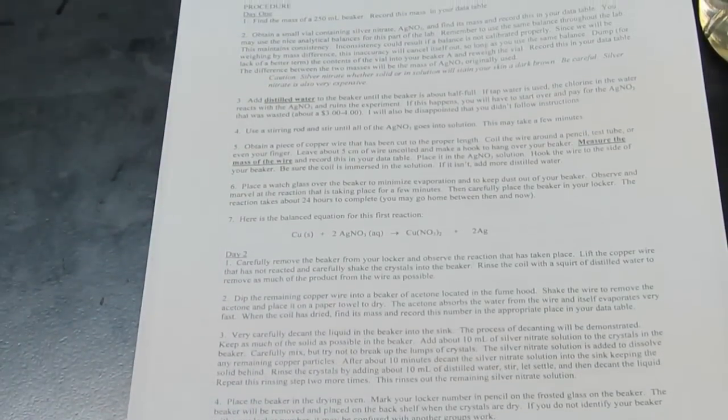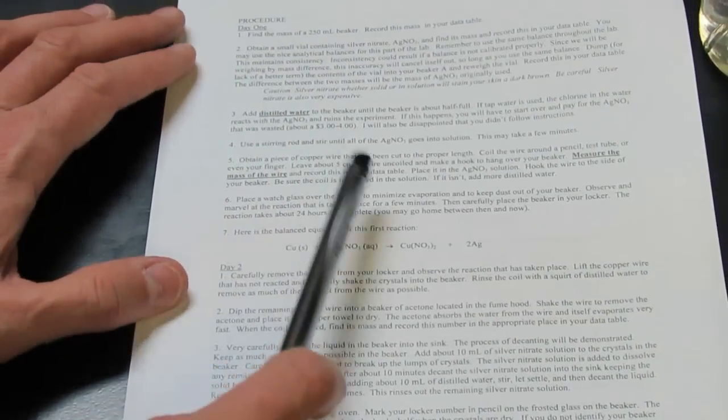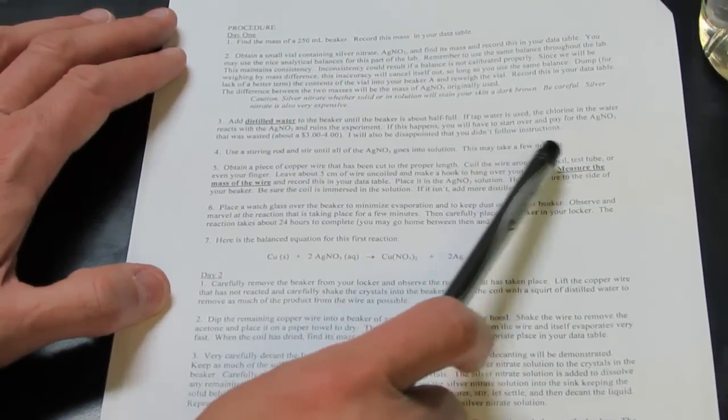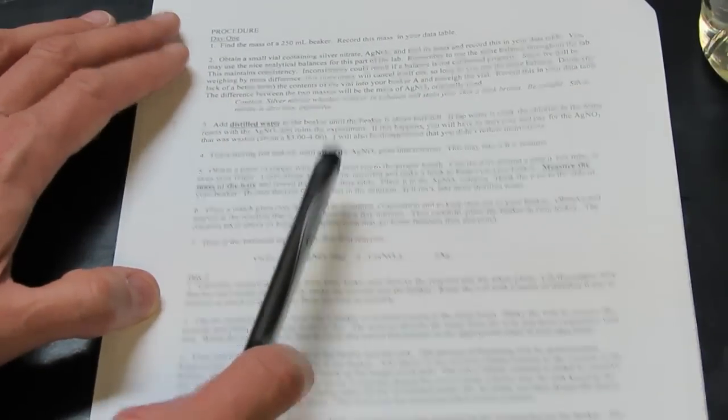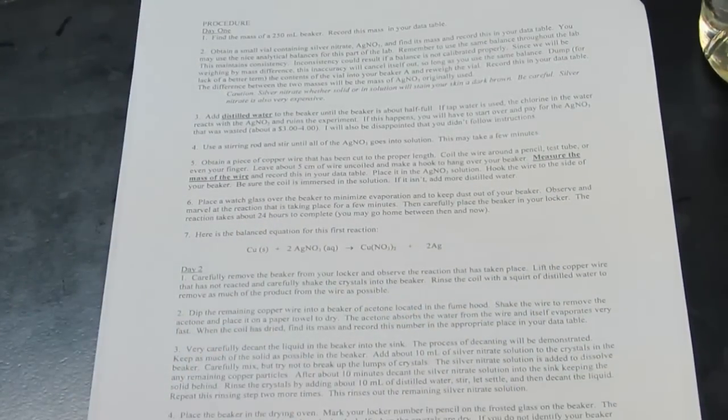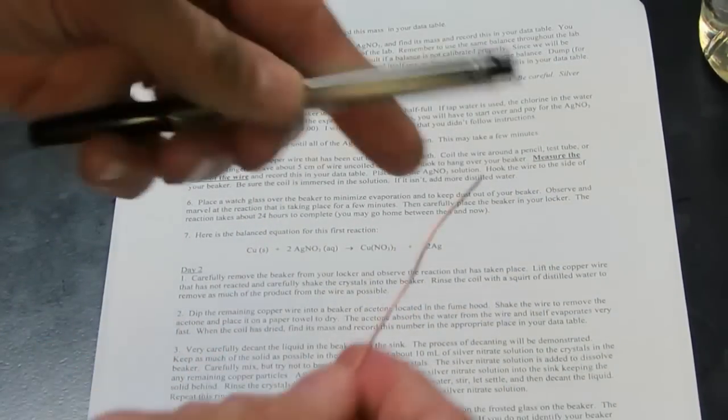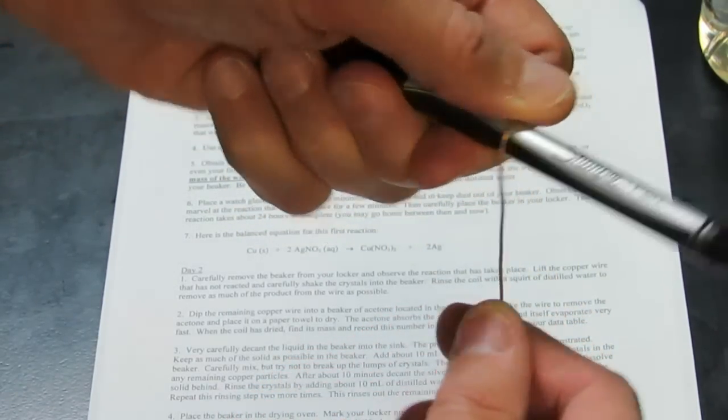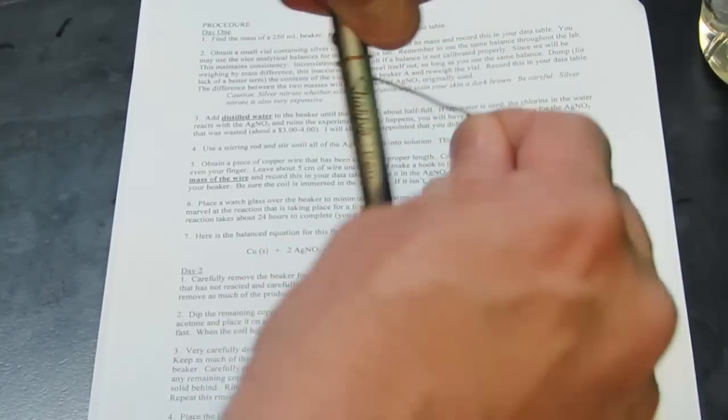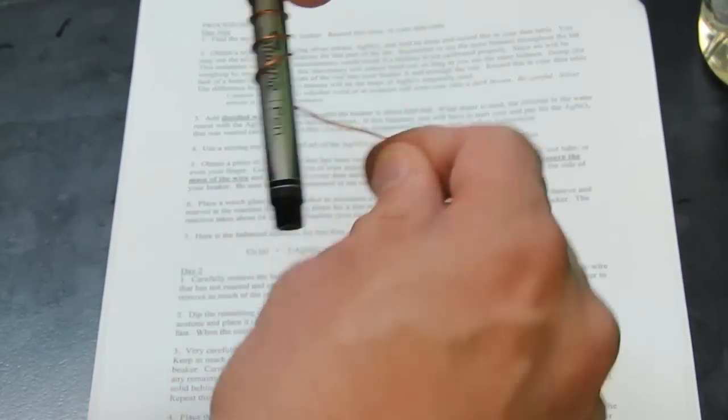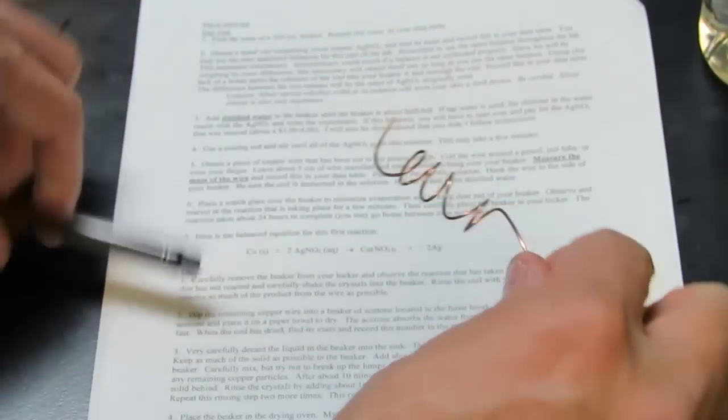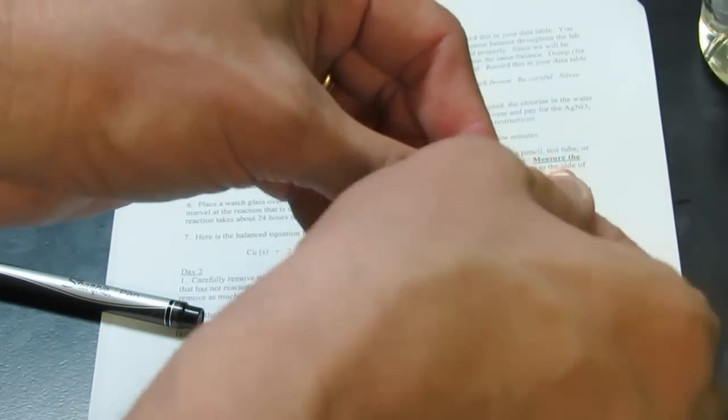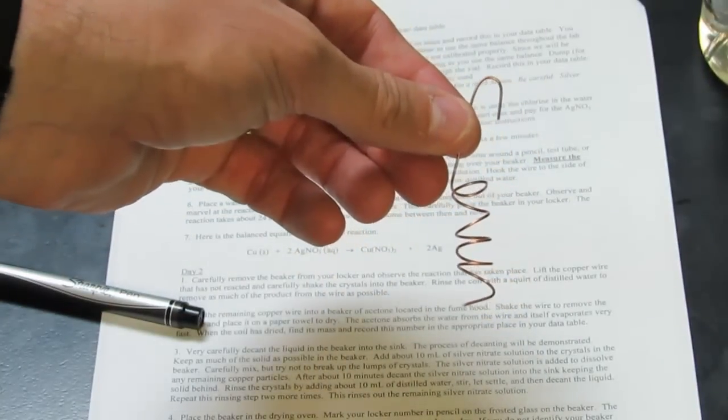Back to our instructions. Coil the wire around a pencil, test tube, or even your finger and leave about five centimeters of the wire uncoiled and make a hook. I'm going to hold the copper wire on my pen with my thumb, and I'm just going to wind it around my pen. We'll leave a bit that's not wound, and then we're going to make a little hook at the tip right there. So your wire should look something like that.